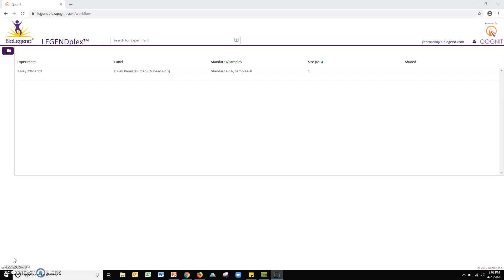For the purposes of this tutorial, we will begin on the software homepage, which is displayed upon logging into the program. To begin, let's create a new experiment.